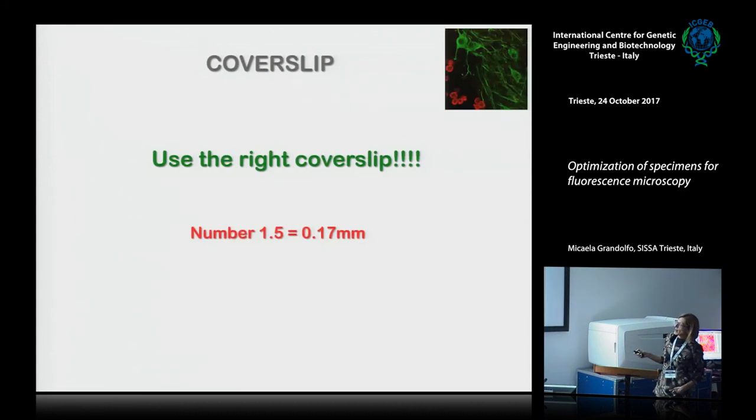Okay? 0.17 millimeter. And some companies do not specify the thickness, but the number of the cover slip is not one, it is 1.5, okay, just for your information.